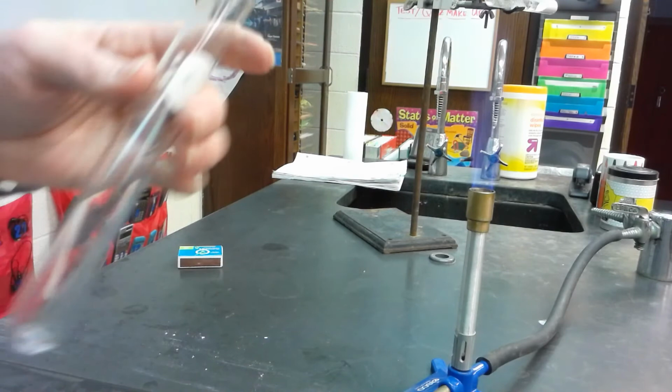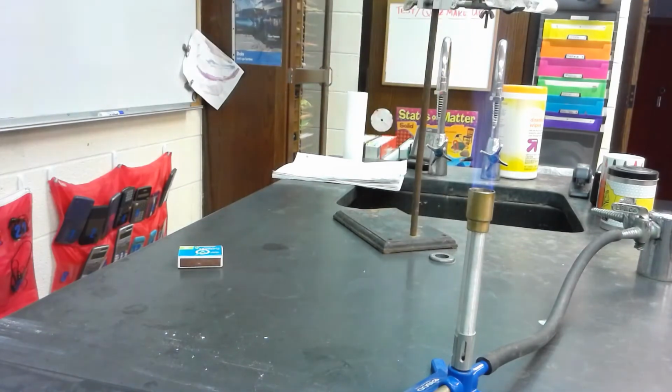All right, let's go ahead and do the next one. So for reaction 5, we have calcium carbonate and hydrochloric acid. Place a small marble chip, which is calcium carbonate, into a test tube and add 2 milliliters of dilute hydrochloric acid. Test the gas evolved with a burning wood splint. Discard the solution in the sink. Return the remaining marble chip to its container.